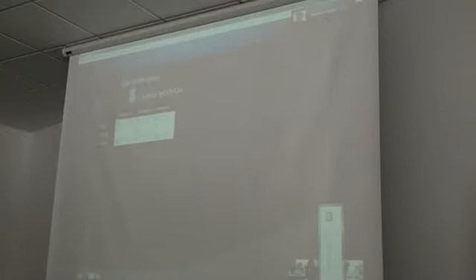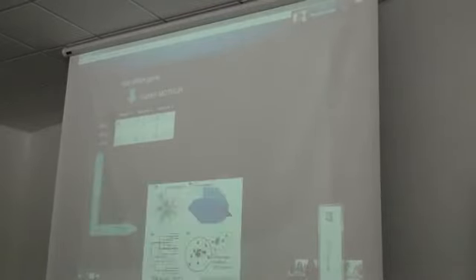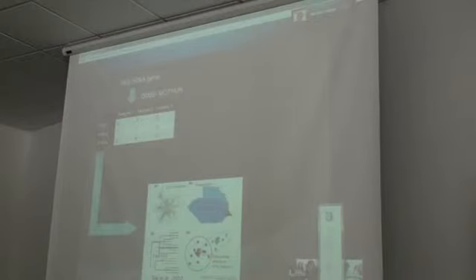And then these OTU IDs either represent an actual number or they're just a filler from de novo OTU picking. And then obviously everything in the table is just an abundance for that OTU in each sample. And then from there you can do lots of things, like you can build phylogenetic trees, you can do PCA analysis, you can do visualization over geographical space if you were doing anything that had actual geography coordinates. You can build networks, all that fun stuff.